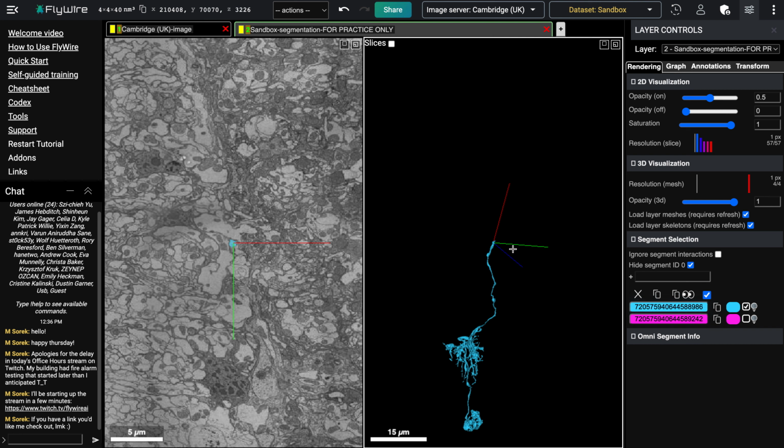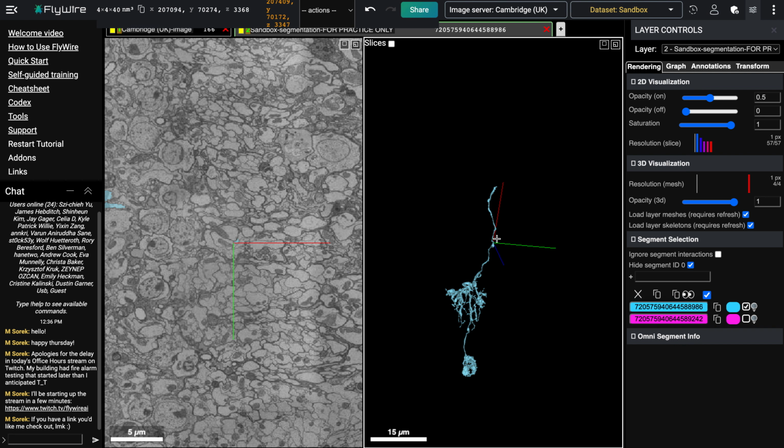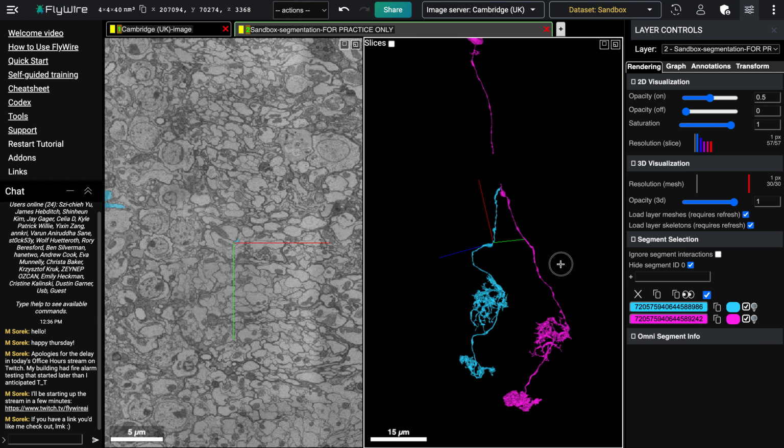It's good if you have an overview of the cell types that are in the area that you're working in. So if you know what kind of cell this is, that'll help give you a clue for what you're looking for on the other side of this jump. For this one, I found a similar cell that's already complete.